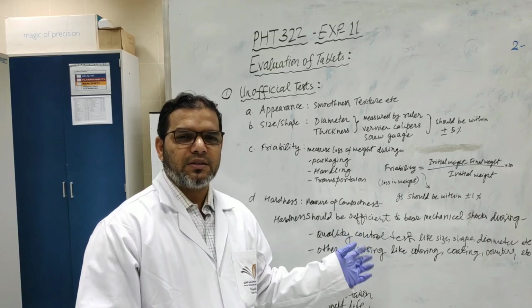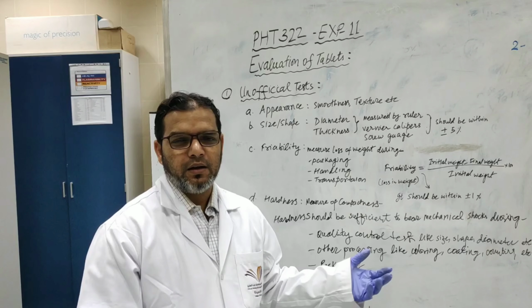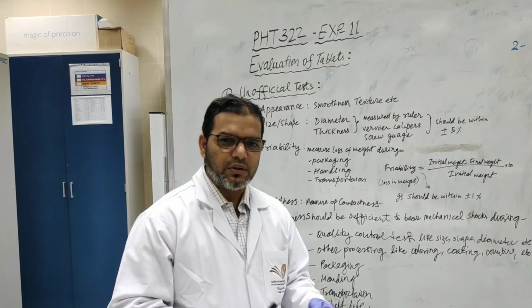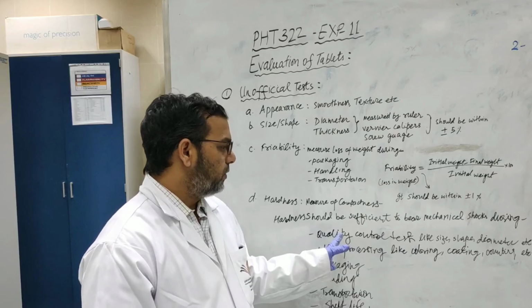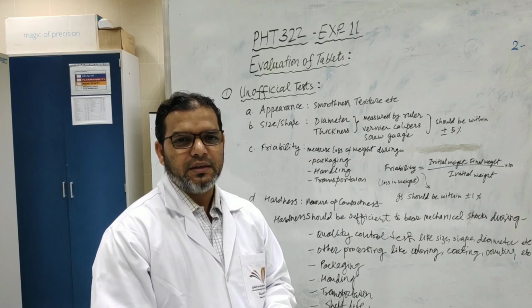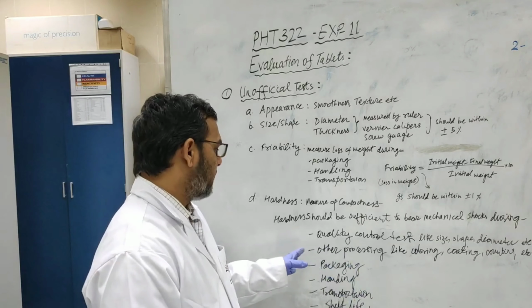If the tablet is not hard enough, it can break down during the testing, so the quality is not good. For this reason, you are going to make a kind of hard tablet so that it can maintain the quality during these tests.